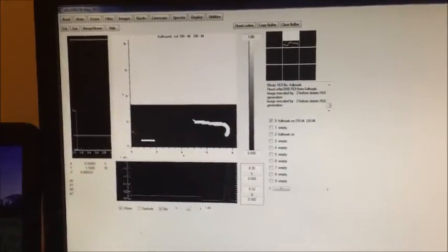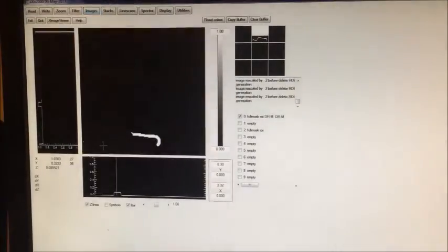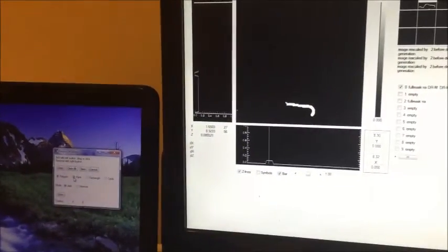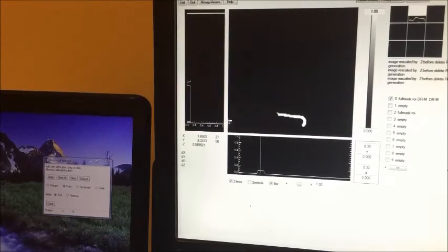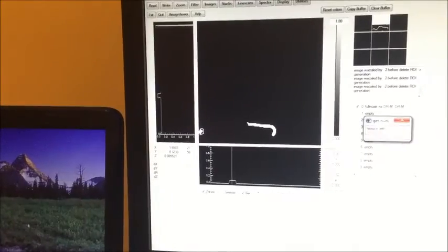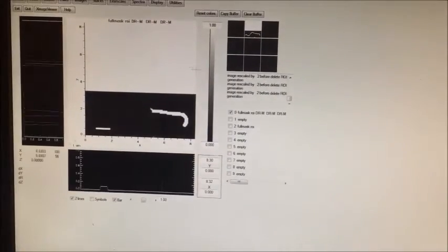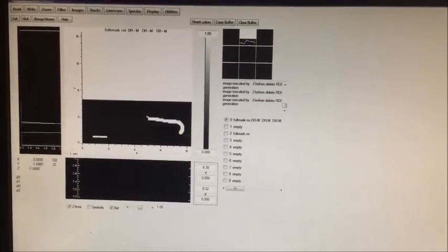There is still some contribution here. I'm again going to do the same thing. Delete region. Select point. Then remove it. Done. Okay, now it looks better. So after this, again you have to generate mask from this region of the nanowire.